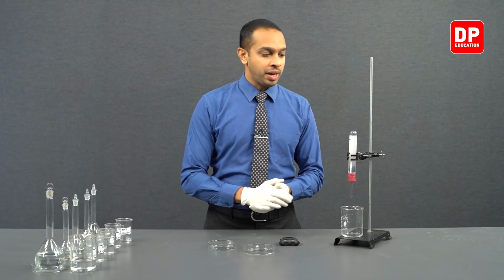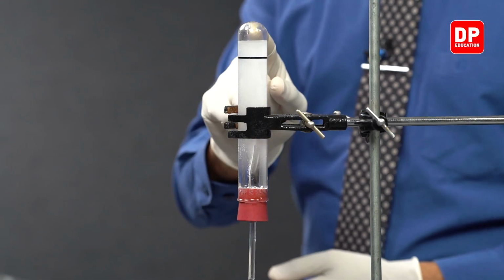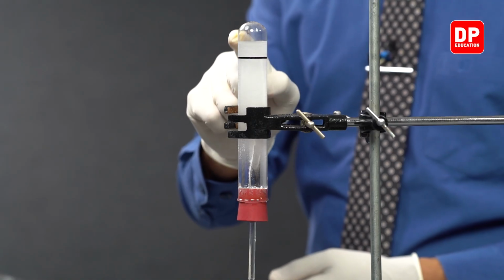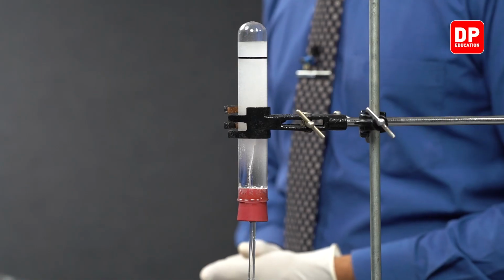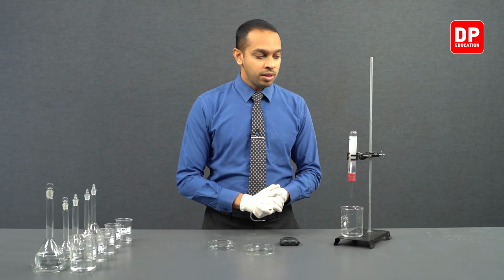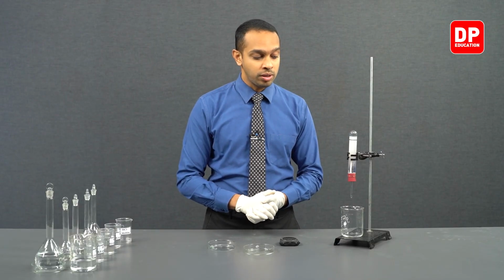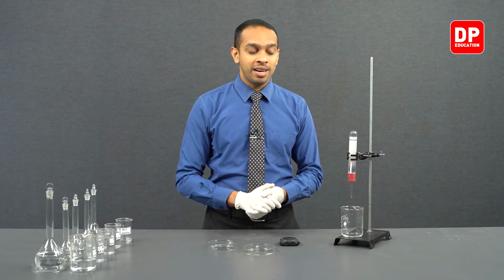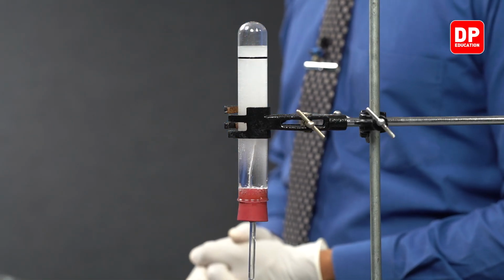Now students, you can see there is a certain amount of hydrogen gas that is collected here, and it is still not collected all the way down to this black mark that we have made on the boiling tube. The time that it has taken to fill this amount of hydrogen gas into the boiling tube is 3 minutes and 50 seconds. We have to wait a little bit longer until this entire area is filled with hydrogen gas.